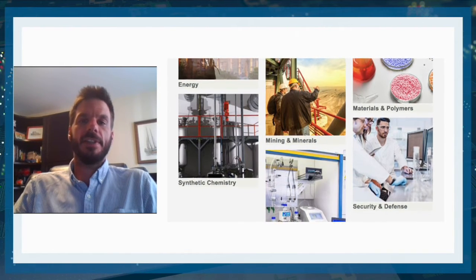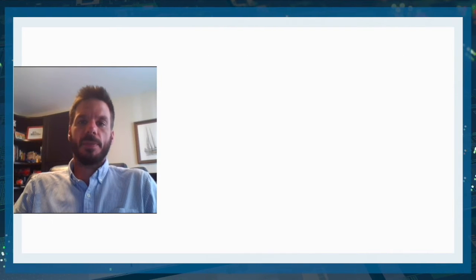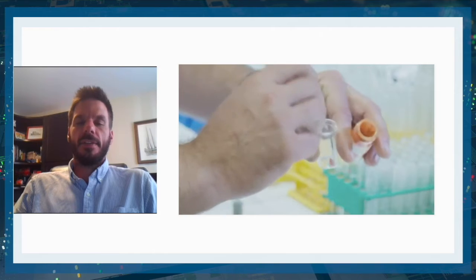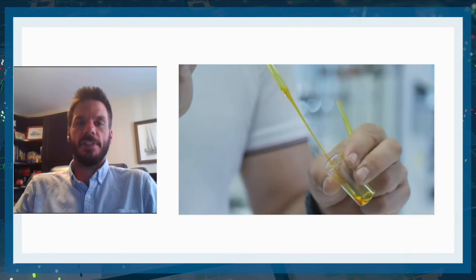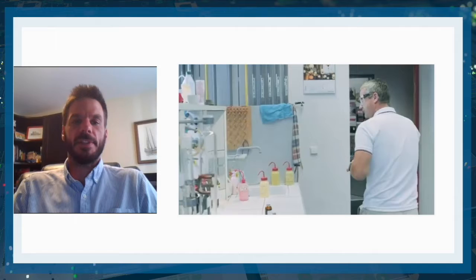It's worth noting that every other major chemical analytical instrument has gone through the process of miniaturization. NMR is the last class of devices to do so. And so we believe that there's a very strong possibility this will be hitting an inflection point in terms of industry adoption very, very soon. And there's good reasons to believe that.